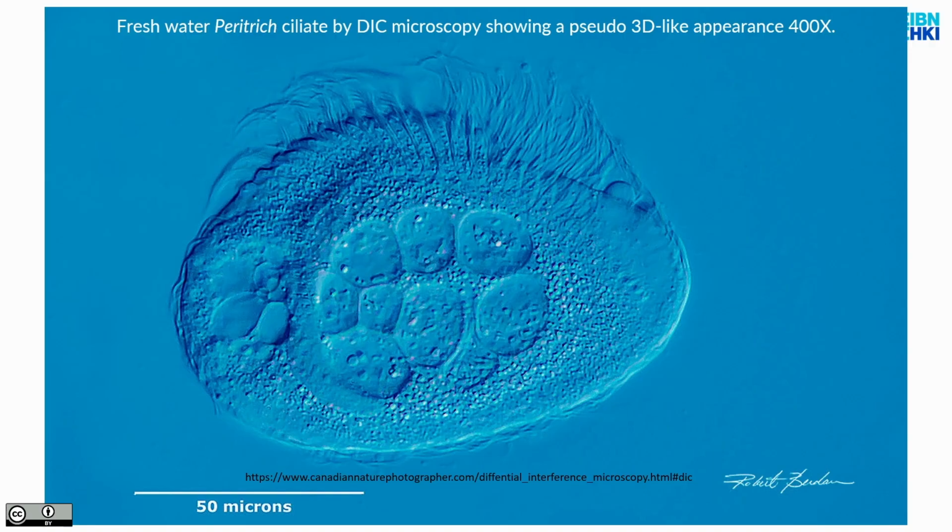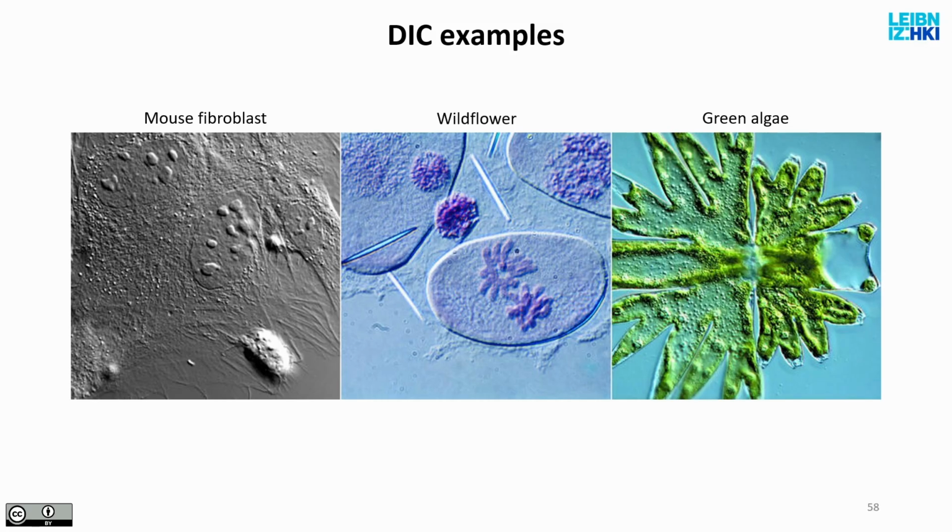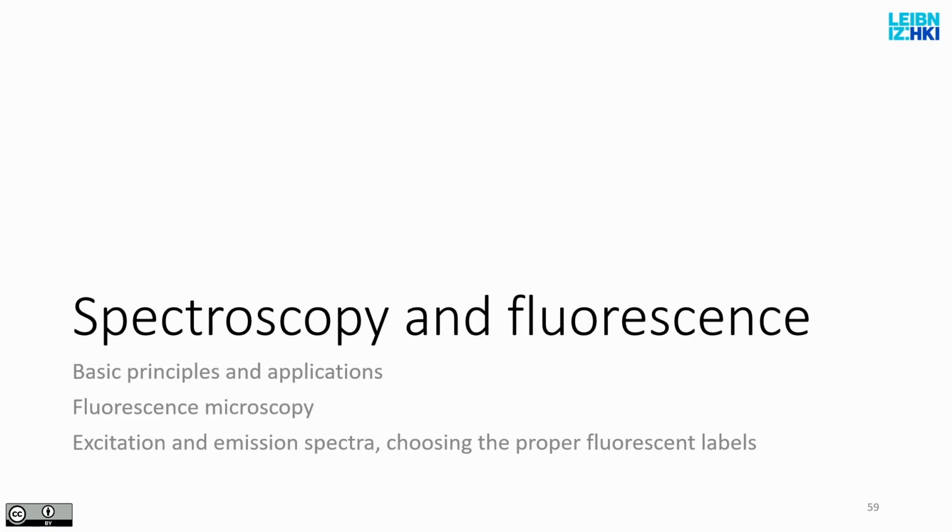How do you know if your microscope is capable? The lens itself will say on the side labeling that it is a DIC system. And various cells, which would otherwise be, for example, fibroblasts, are very, very thin and would be very difficult to see without generating this interference contrast.